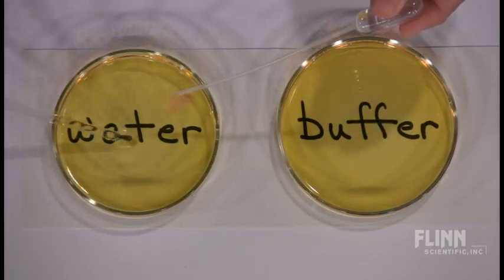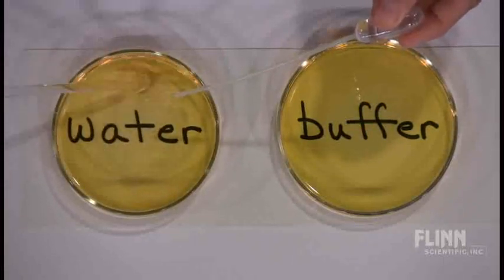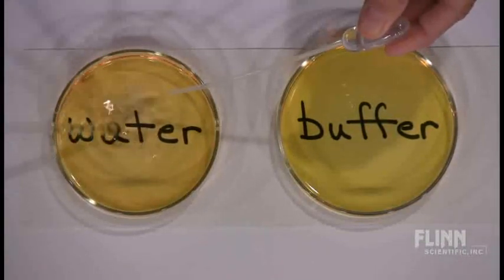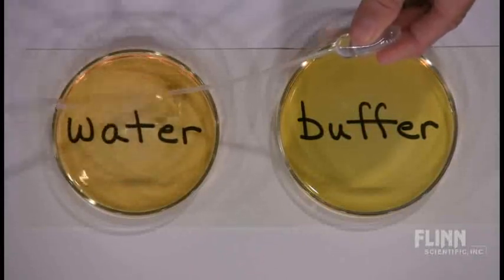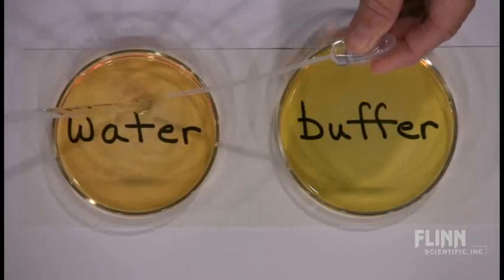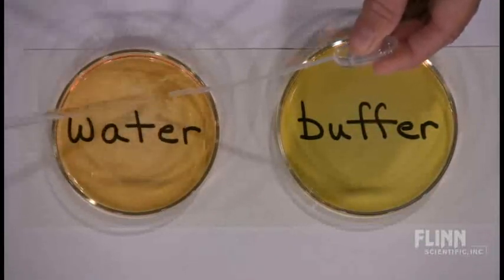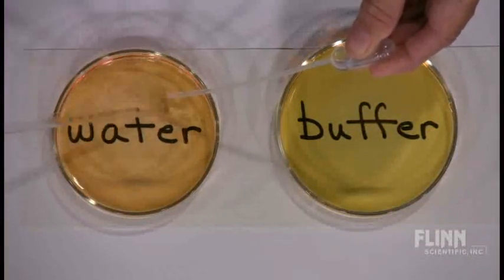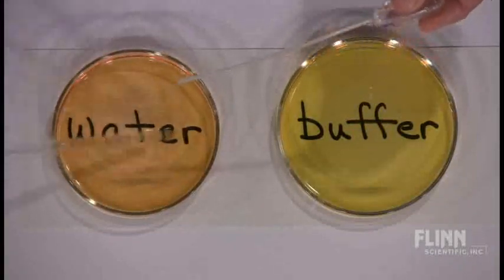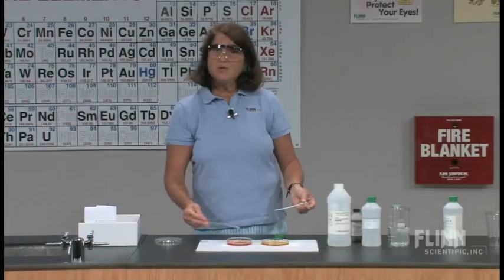Let's do a count, focusing on the petri dish: 1, 2, 3, 4, 5, 6, 7, 8, 9, 10, 11, 12, 13, 14, 15, 16, 17, 18, 19, 20, 21, 22, 23, 24, 25. That does have a different coloration — sort of an orange.